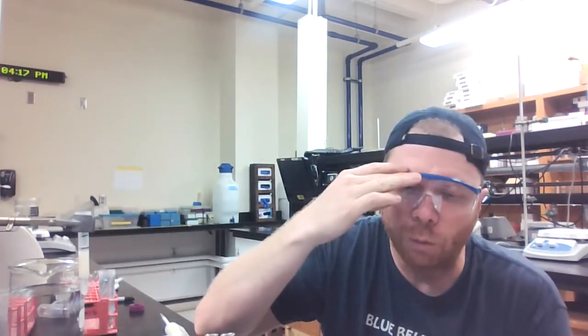So fraction number 18, getting a negative number where there's effectively no protein in there, kind of makes sense. Number 19, I see an absorbance of 0.120. Okay, that's a spike in protein. So that's my first peak that indicates that I do indeed have protein that is eluting off of that column. Fraction number 20 is 0.071.